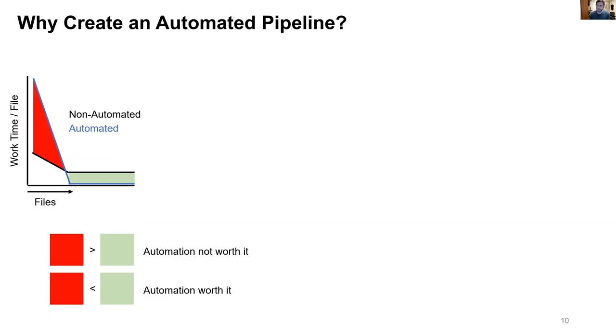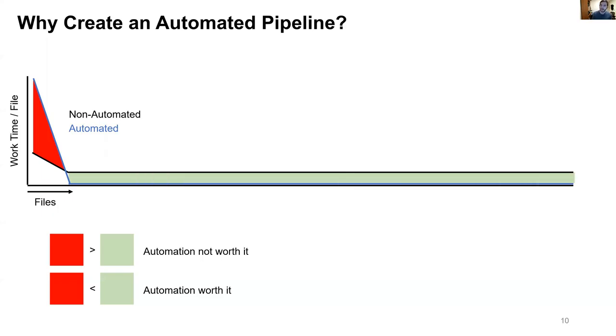And this is especially true for something that you're going to be collecting for an extended period of time. Like in my case, I'm setting this up for fiber photometry for my projects for the rest of my postdoc, but also this pipeline will be used by other people in the lab. In the end, it's going to save us an extraordinary amount of time compared to doing anything manually along the way. So that's the first one, just saving time.